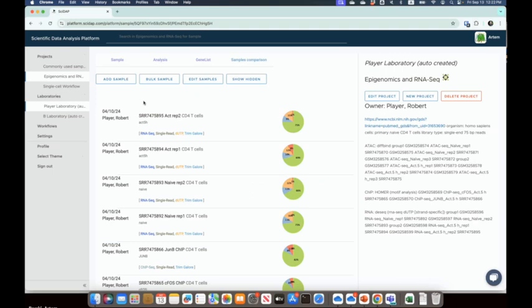This is to avoid comparison between apples and oranges: data processed with one pipeline versus another. If you go to edit project, you can attach pipelines to the project from either Datirium's pipeline library, or you can connect your own GitHub if you want your own pipelines.